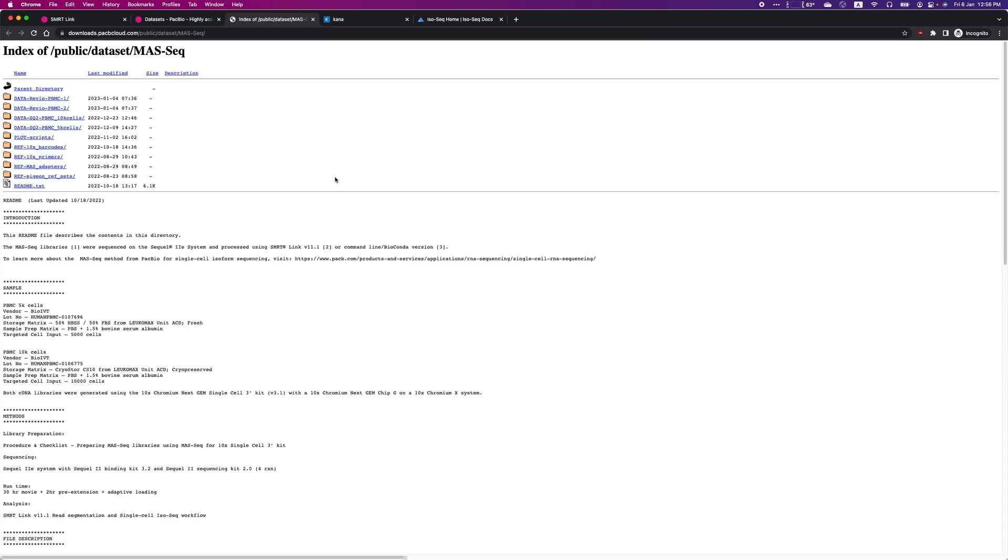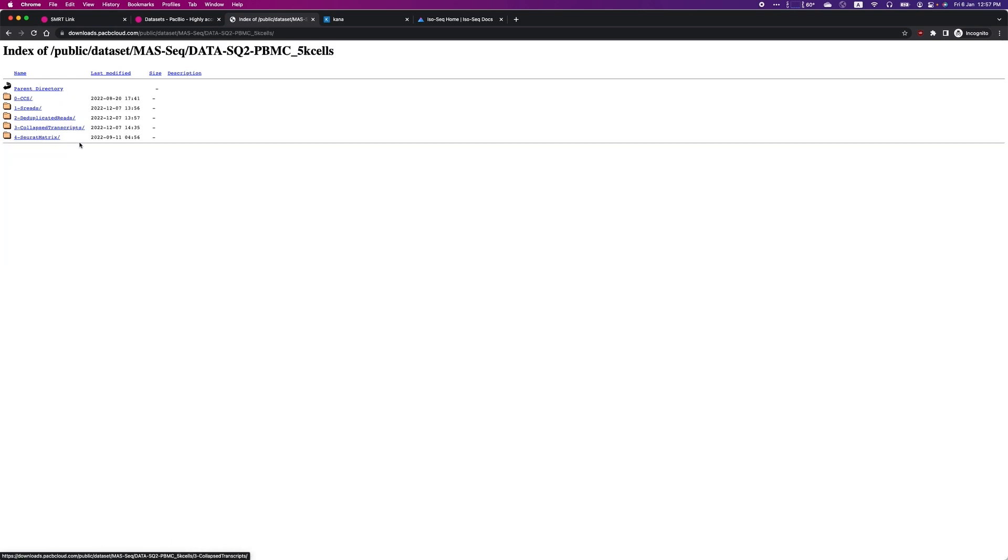Here, you can see there are multiple datasets, including one with 5,000 PBMC cells and one with 10,000 PBMC cells. For the purpose of the demo today, we will look at the 5,000 PBMC cells dataset.